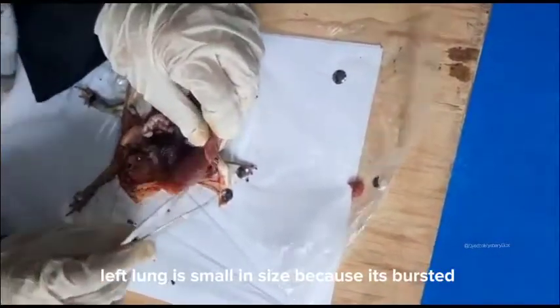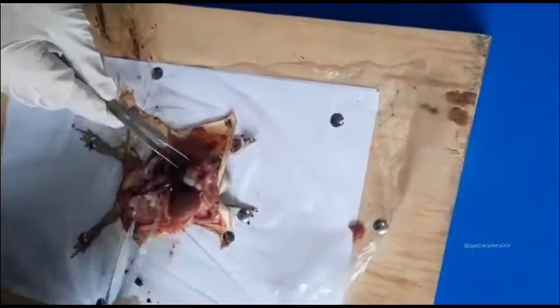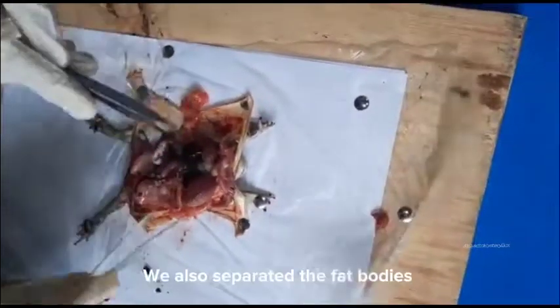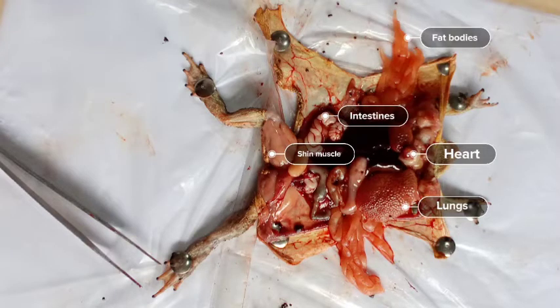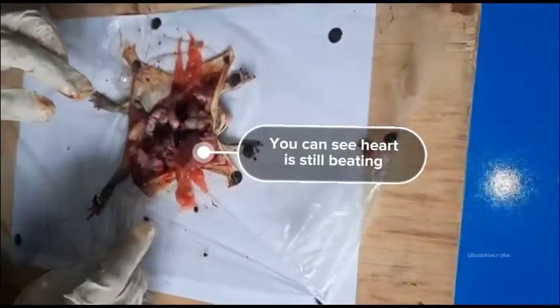The left lung is small in size because it's burst. We also separated the fat bodies. You can see the heart is still beating.